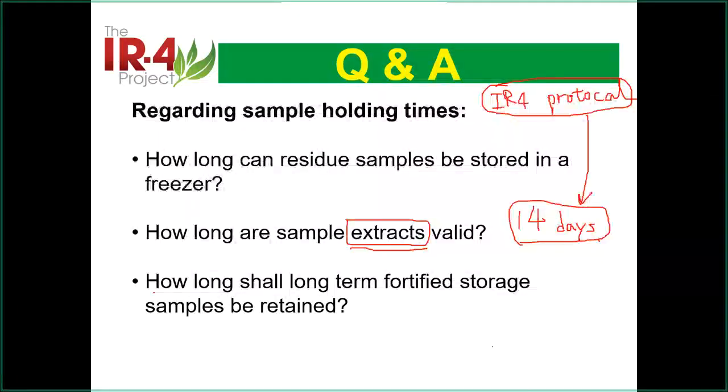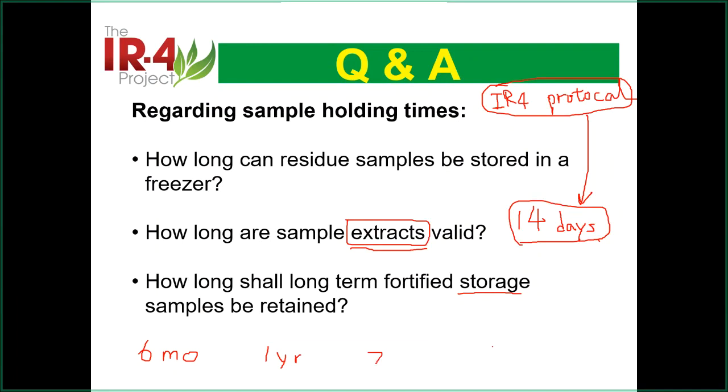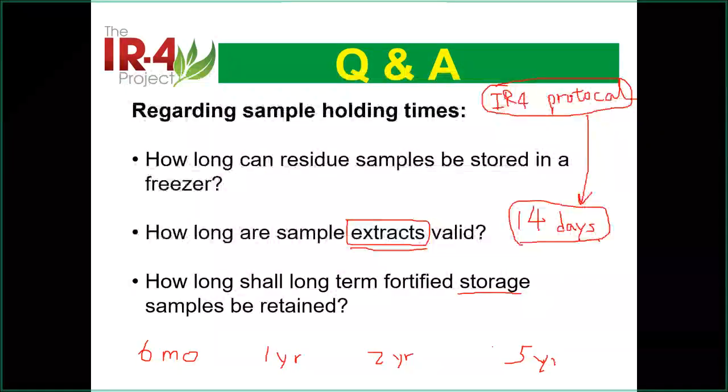And the next one is how long the storage sample should be retained. For example, after you finish all the study, everything, how long? Okay, I also put it there. We put 6 months, for example, and 1 year, 2 years, and 5 years. So what do you think?